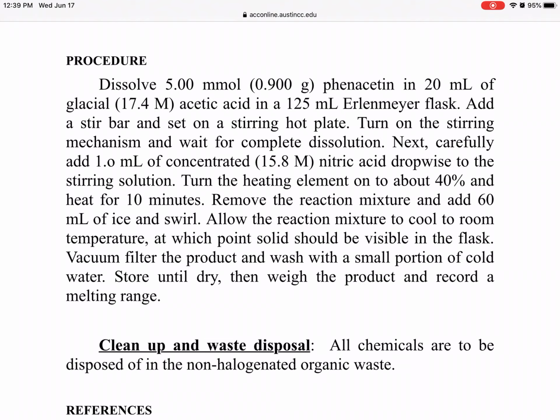So now you have to do another vacuum filtration to isolate your crystals. You isolate your product on the filter paper, let go of the filtrate, and then you dry it.